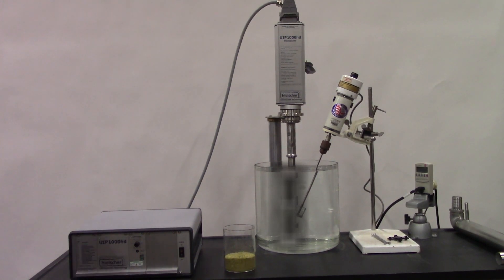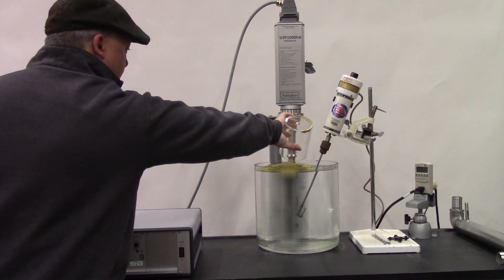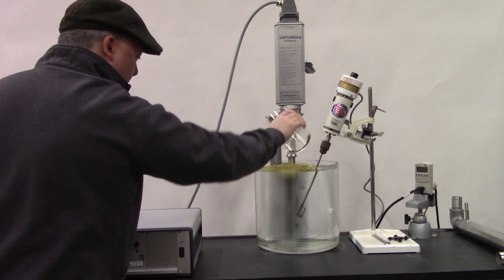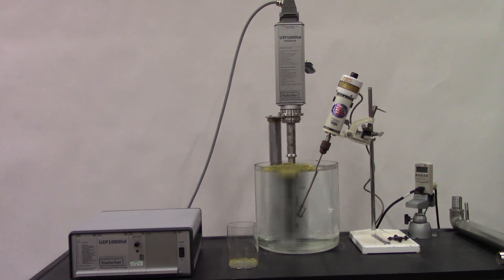Today at High Tech Trader, we're going to be looking at and demoing an extraction process. We're just going to add our hops in, our ground hops. We're going to be using a UIP-1000 HD generator and transducer setup from Hielscher Ultrasonics.